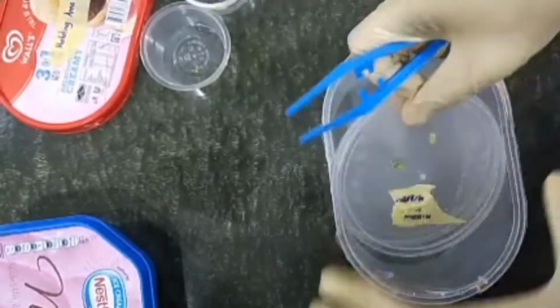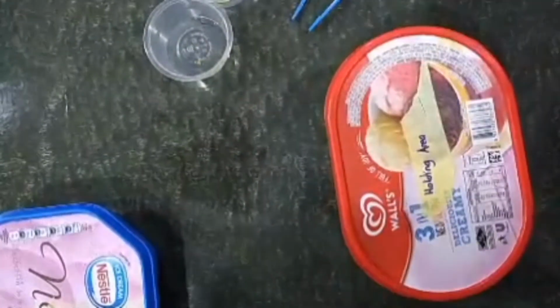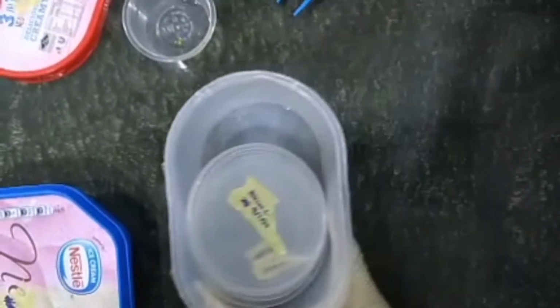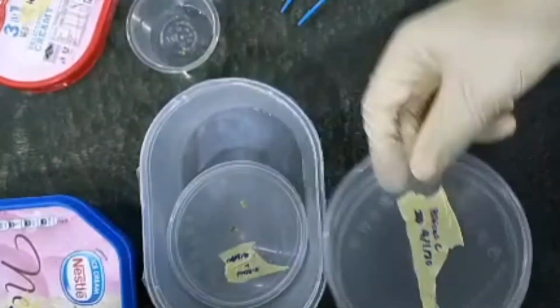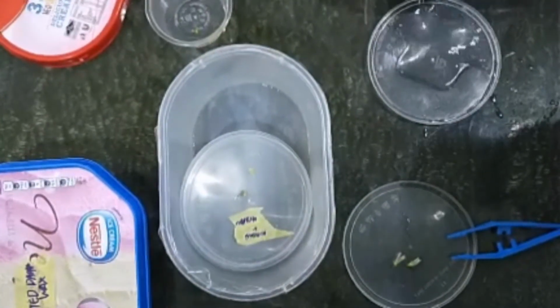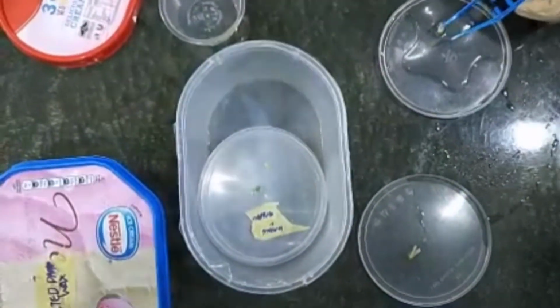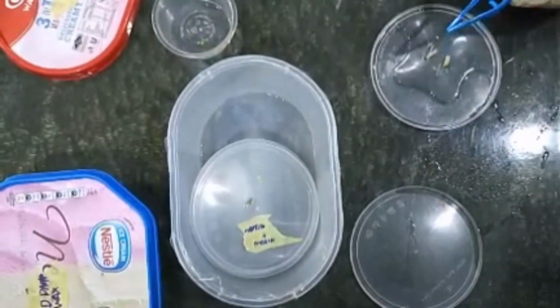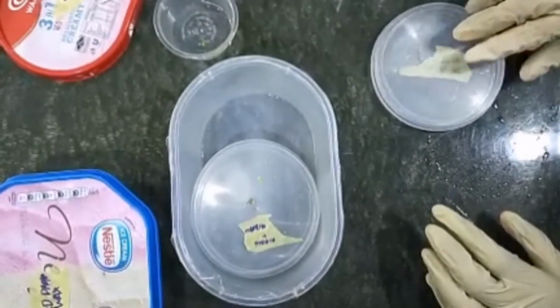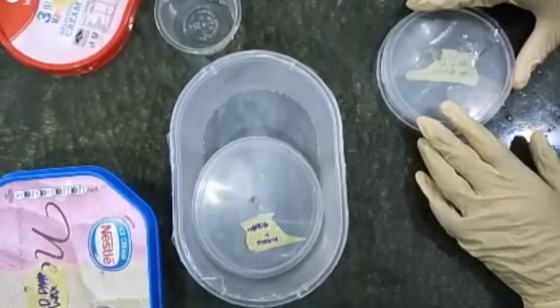We will place the specimen in the holding area which is filled with paraffin wax. After the specimen is ready, take out the specimen and choose the right size of the mold. Dispense the paraffin wax into the mold. Place the specimen in the wax with the area of interest facing down. Then, use a label cassette and place it on the mold and gently press it into the mold. After that, top up with some paraffin wax.